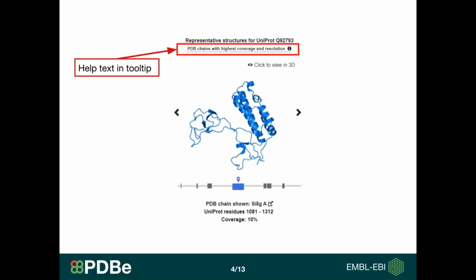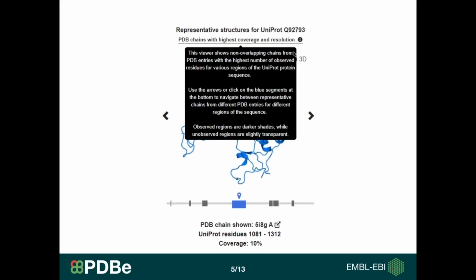At the top of this visualization component, you have a help text tooltip. So if you were to go there, you would see a brief description of what we have available within this component and what it is that you see here.